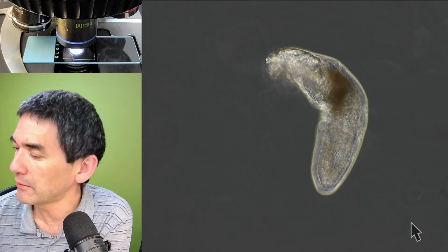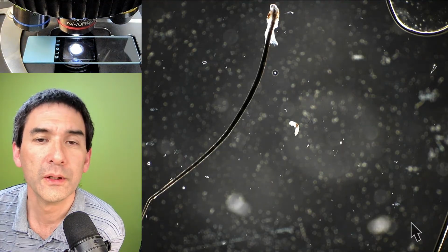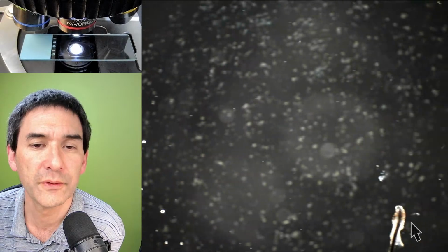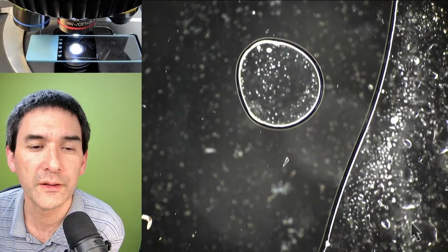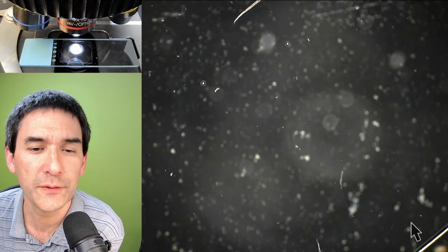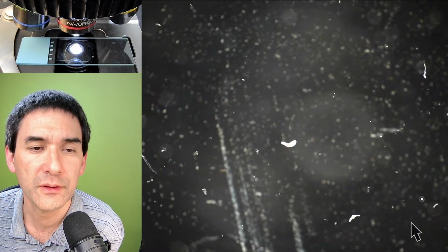But okay, what I'm gonna do now, I think I might actually look for dark field at low power. Let's see if I'm able to find the other one. Where was the other one? I wonder if I'm able to find the other one, because when I added the cover glass, of course, everything shifted a little bit. Otherwise we just, here it is.